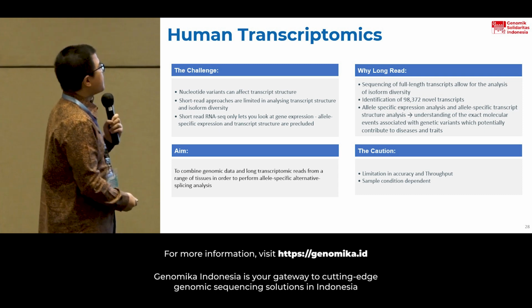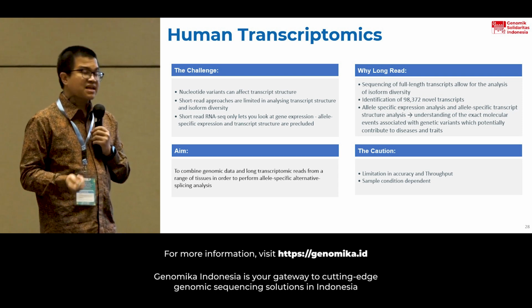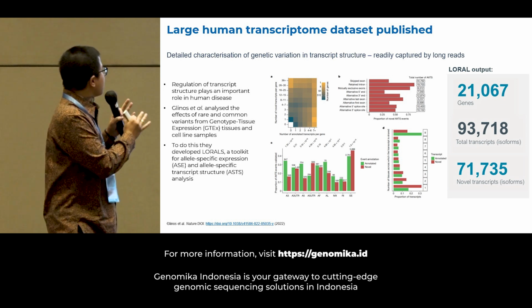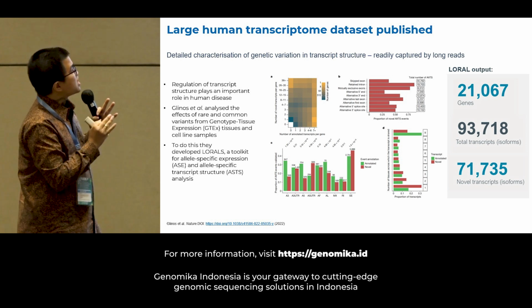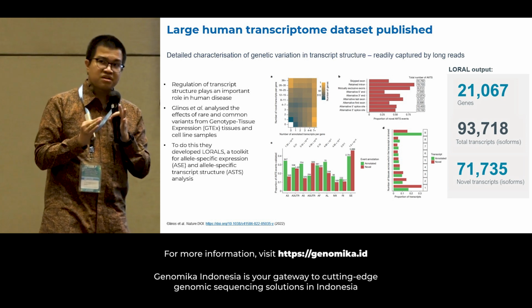sample, for example. Now, of course, there are strengths and weaknesses, and all of this require discussion. And a lot of this can be seen on the versatility of it from a publication in Nature, I think around 2 years ago, 2022, that showed the robustness of analysis for transcriptomics using next-generation long-read sequencing.